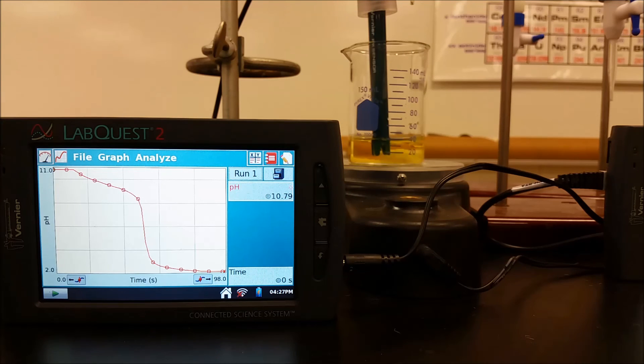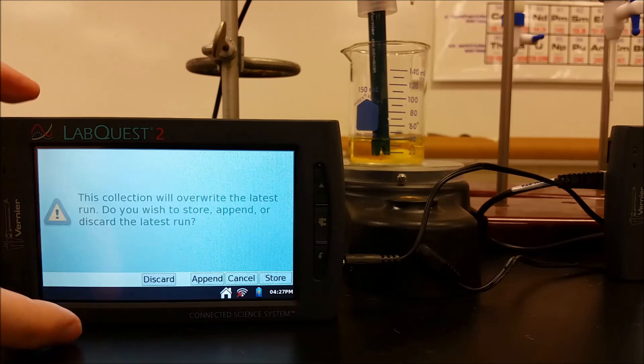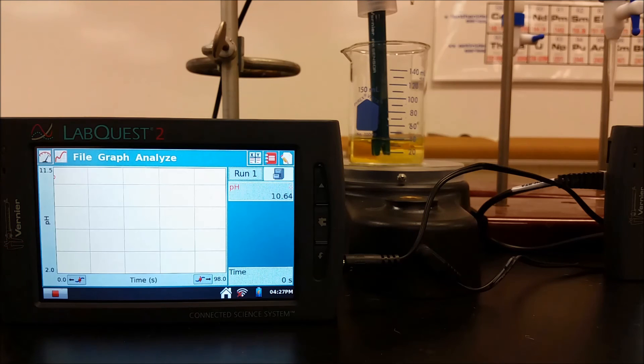So we have our 0.1 molar ammonia. It's been diluted with some distilled water. And now we're going to add the hydrochloric acid to it that's 0.1 molar as well. And I'm going to run the pH meter here to give us our titration curve. This time when we run it, this is going to work where the equivalence point and the endpoint should be about the same.